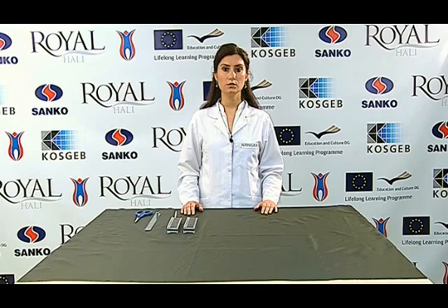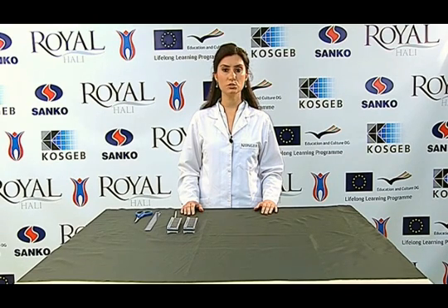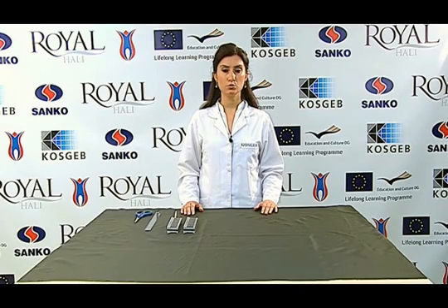When preparing samples, the fabric specimen is not taken from places too close to the edges. Specimens must be taken from no nearer the selvage than 150 mm. In addition, specimens must not be taken from wrinkled places and places where there are folding traces.